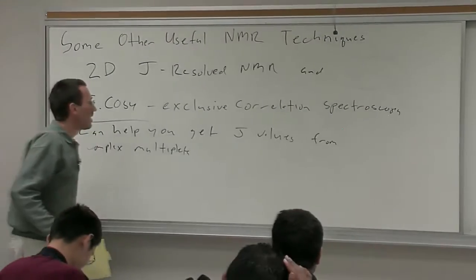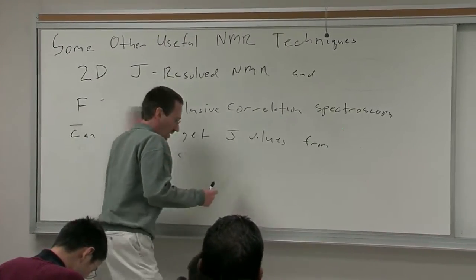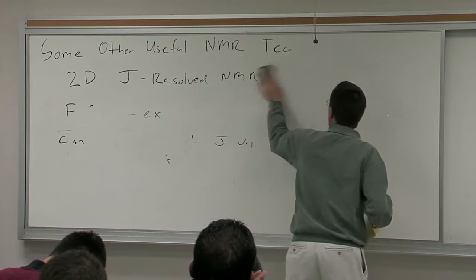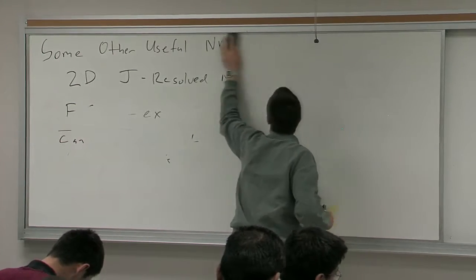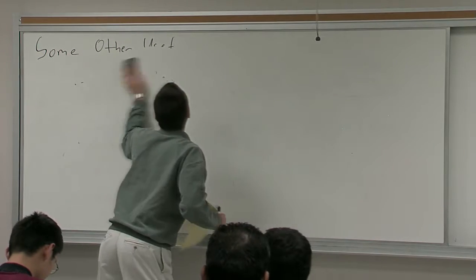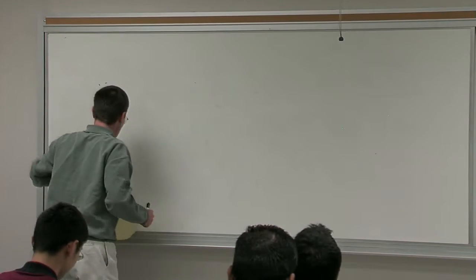Now, the one that we haven't talked a lot about is chirality and using NMR spectroscopy as a tool to analyze enantiomeric purity.